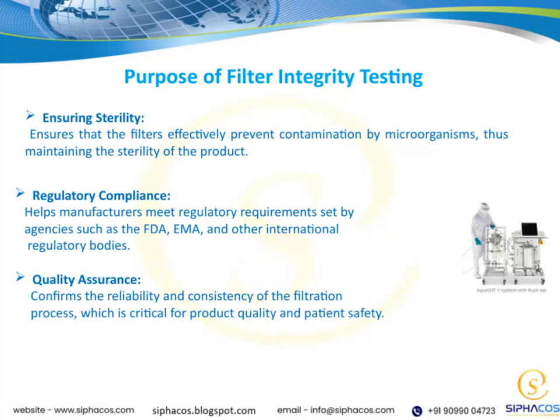Ensuring sterility is absolutely crucial in our processes. It's about making sure that the filters we use are effectively preventing contamination by microorganisms. When these filters do their job properly, they help us maintain the sterility of the final product, which is essential for patient safety and product integrity. Now, one key aspect of this is filter integrity testing. This testing helps us verify that our filtration systems are functioning as they should be.